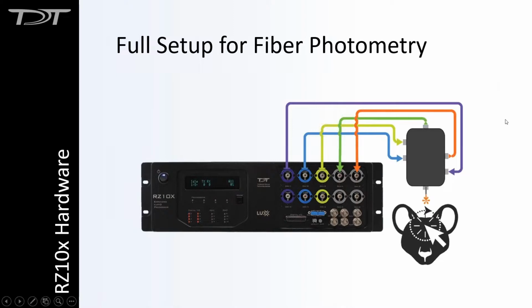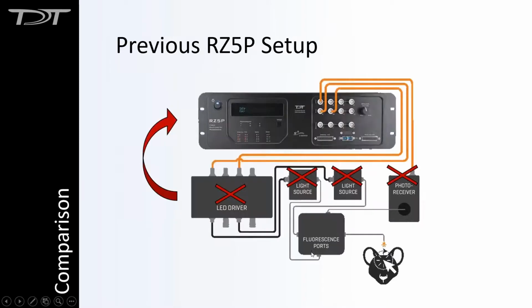Eric from University of Washington is interested in knowing, in addition to the timing control, how amenable is the software for integrating an automated trigger control with a separate software. With a separate software. We would have to talk with you, I think, more specifically about what you're looking to do, just to make sure that we have the right solution.